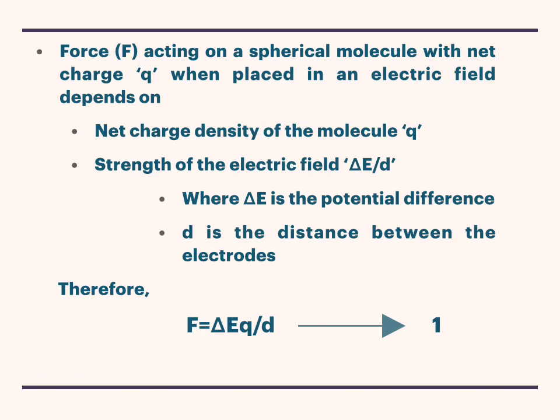This force exerted on the molecule depends upon the density of the net charge on the molecule and the strength of the electric field applied. Hence, we derive that the force acting on the molecule is equal to the potential difference applied between the electrodes and the charge on the molecule, divided by d, where d is the distance between the two electrodes. Let us number this equation 1.